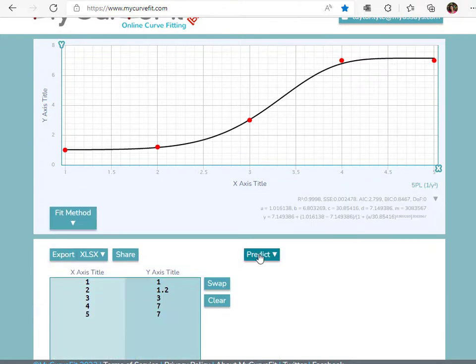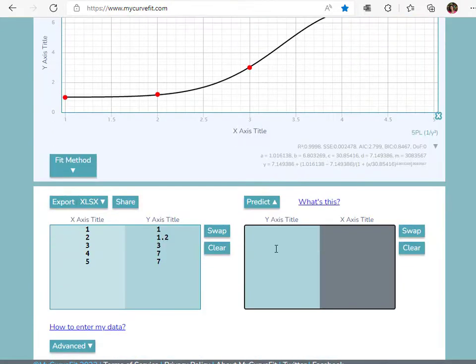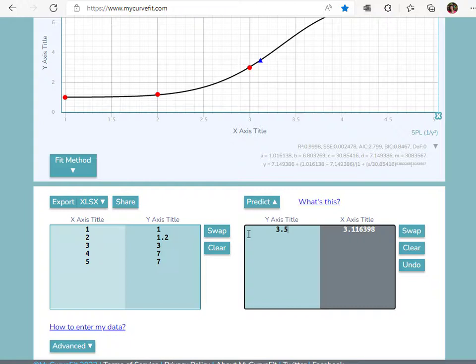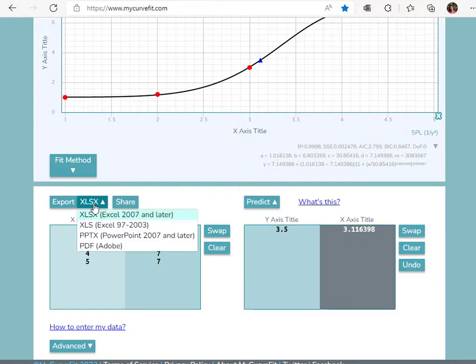Using the predict option, you can enter known X or Y values, and using the curve fit equation, the unknown X or Y value is calculated. Export your results to Excel, PowerPoint, or PDF.